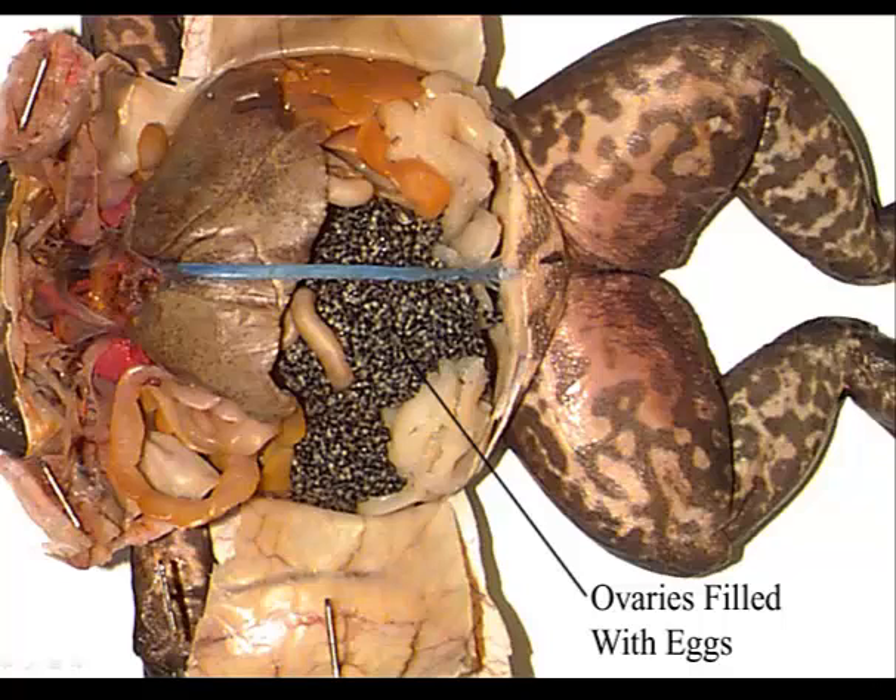One of the other things you'll see a lot of are these orange finger-like projections. These are fat bodies, and they're essentially big fat cells.